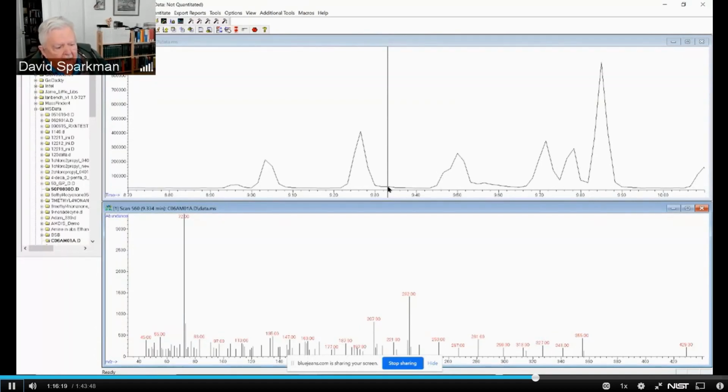Okay. Well, I said that's very challenging because look at what a low total ion current that spectrum gives. But as I looked at that spectrum, I saw a number of things that were very interesting about it. One of the things was there were several peaks, 207, 281, and 355, and 429. Those peaks are indicative of GC column bleed.